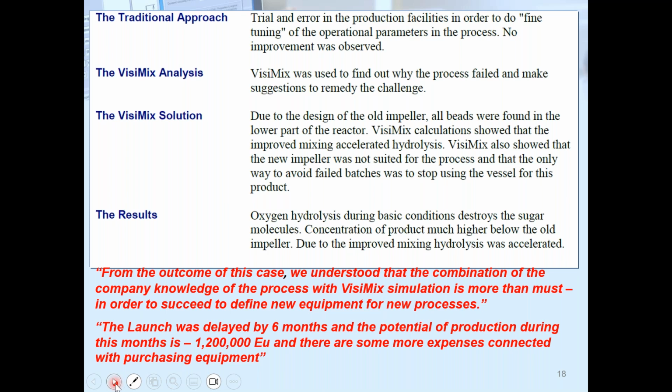So in this case, when they wanted to design equipment that would be good by providing homogeneity of solids, they generated bad results. The idea is to understand that we need to connect the mixing with the process, where the mixing is the service. We need to ask the process what is required and find the conditions that, with the mixing, will provide the process the solution.